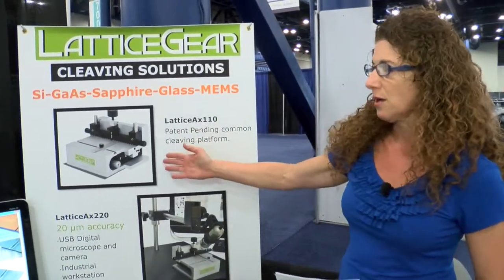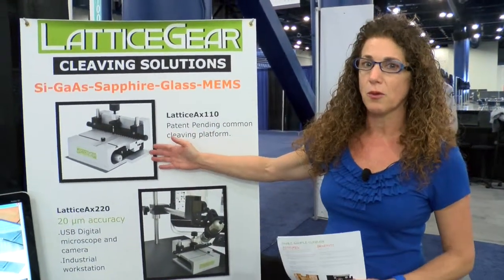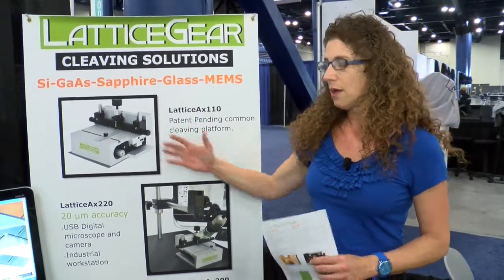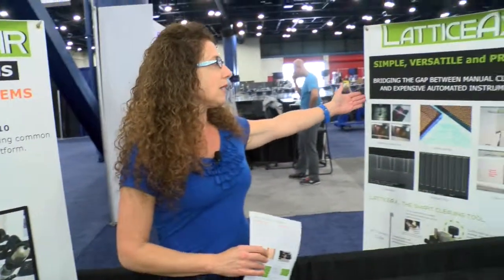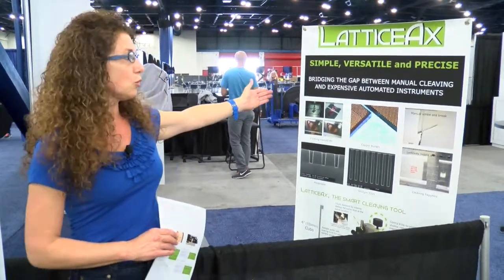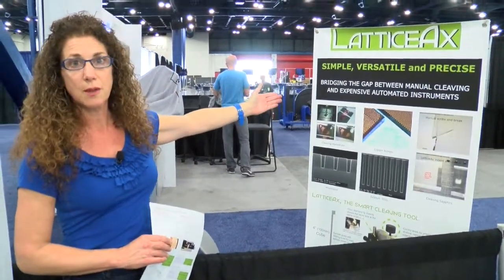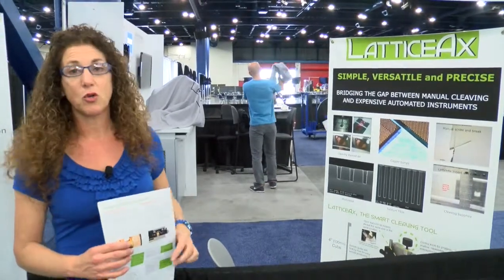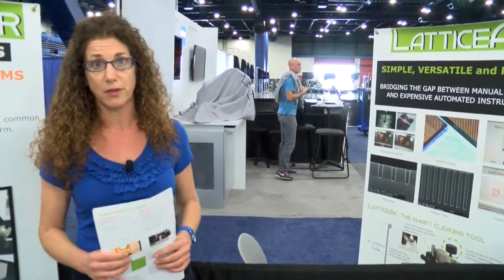Hi, my name is Afrat. In 2012 we introduced you with a new cleaving platform, the LatticeX Cleaving Platform. The LatticeX bridges the gap between manual cleaving and expensive automated instruments by micro-indentation followed by a three-point cleaving.